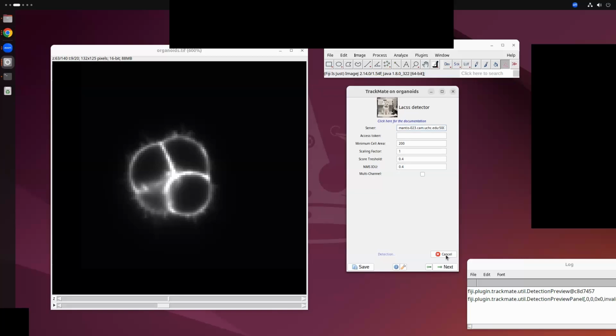You can always make a quick detection to see how the preview looks. So in 3D, it should show the segmentation of each cell. It may not be very easy to see on your computer, but it shows up. There are 4 cells here. There are 2 dots that represent the two cells that are invisible, but they're there.